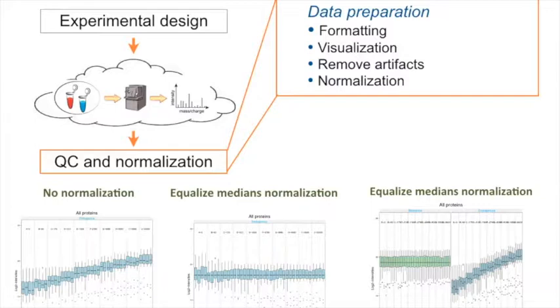I think there was a question. Do you use median for large data sets also, just because of convenience, because you use it for small data sets as well? Maybe it's more robust for small data sets, but if you have really large data sets, median and mean. Actually, we use median normalization primarily for large data sets, but we would not use it for small data sets.